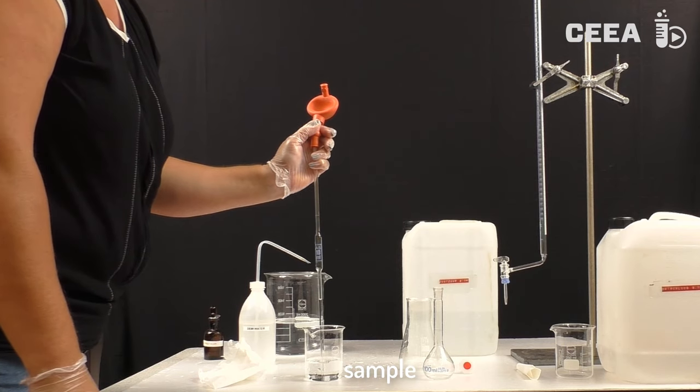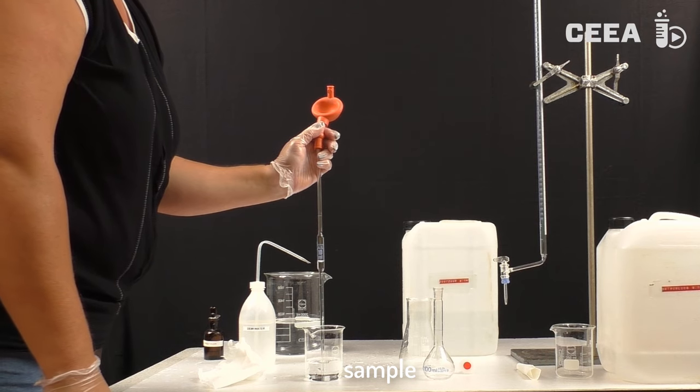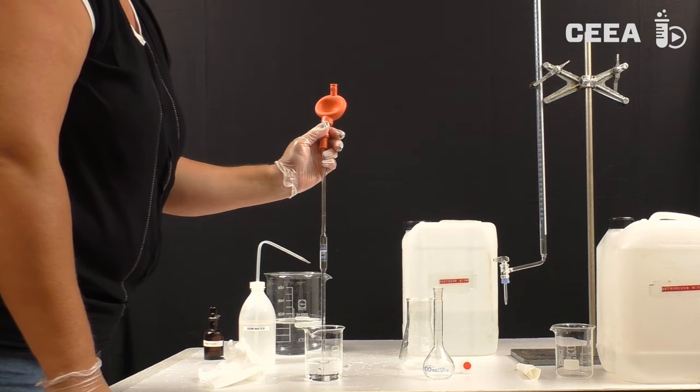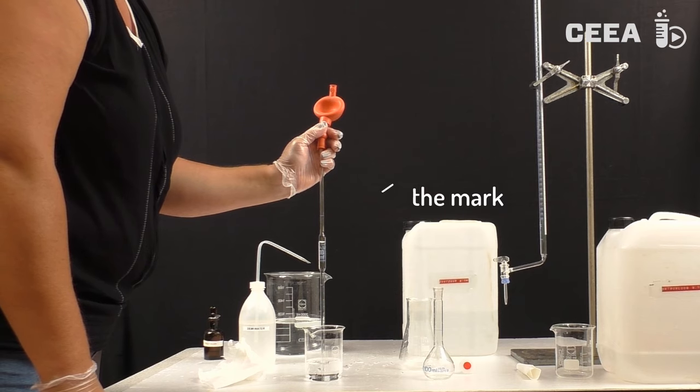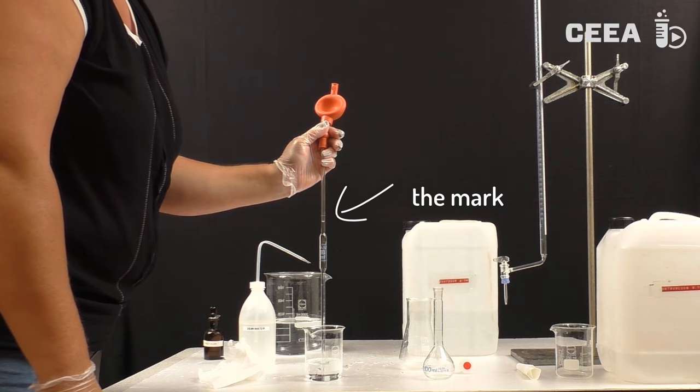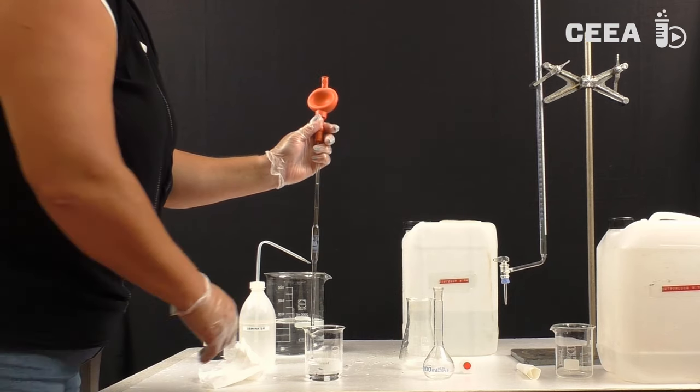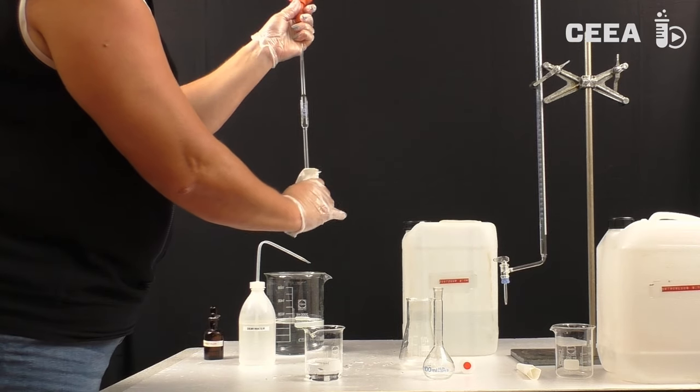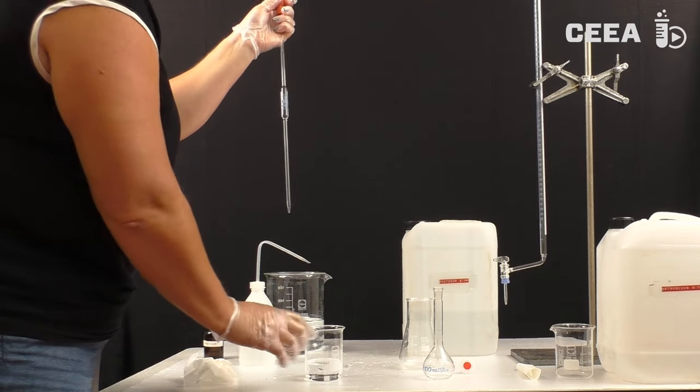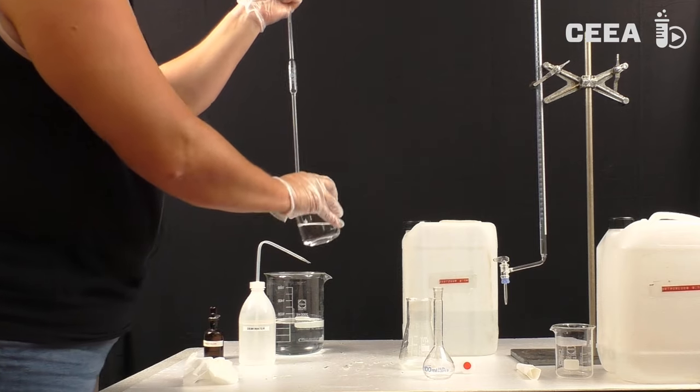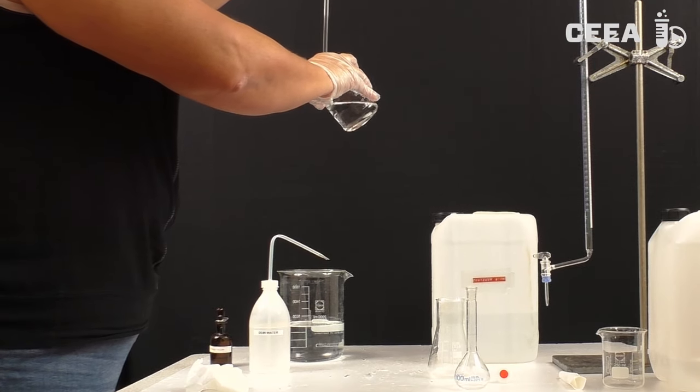Now the pipette has to be filled with sample. We fill the pipette using a balloon to some centimeters above the mark. We dry the outside of the pipette with filter paper, then, in order to get an accurate amount of sample, we let the surplus flow back into the beaker at an angle of 45 degrees.